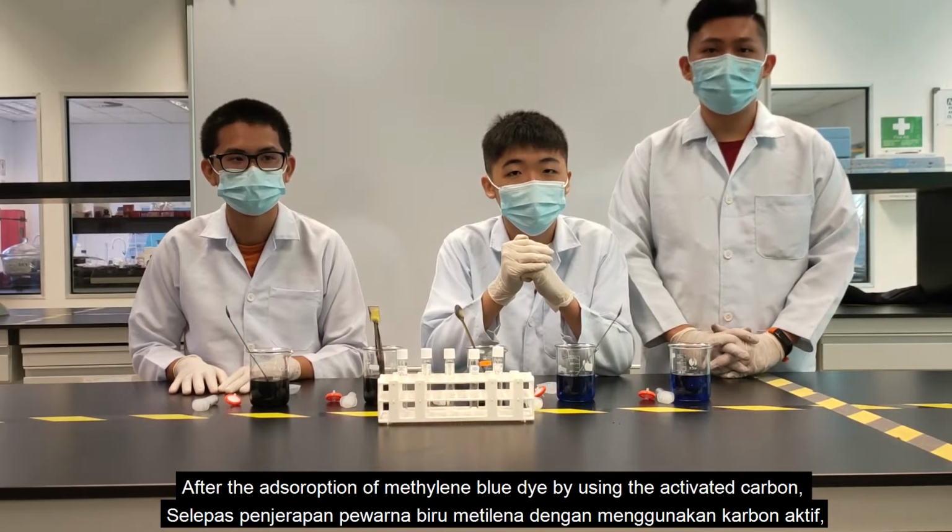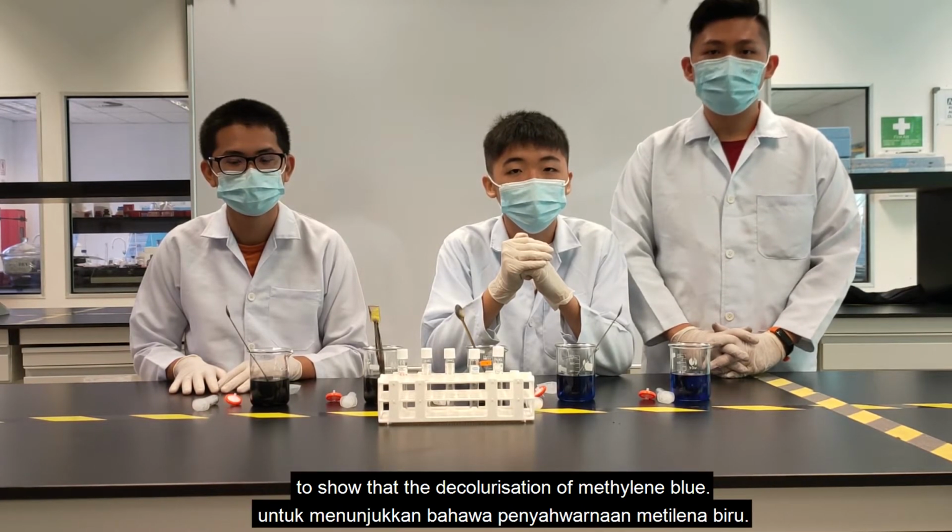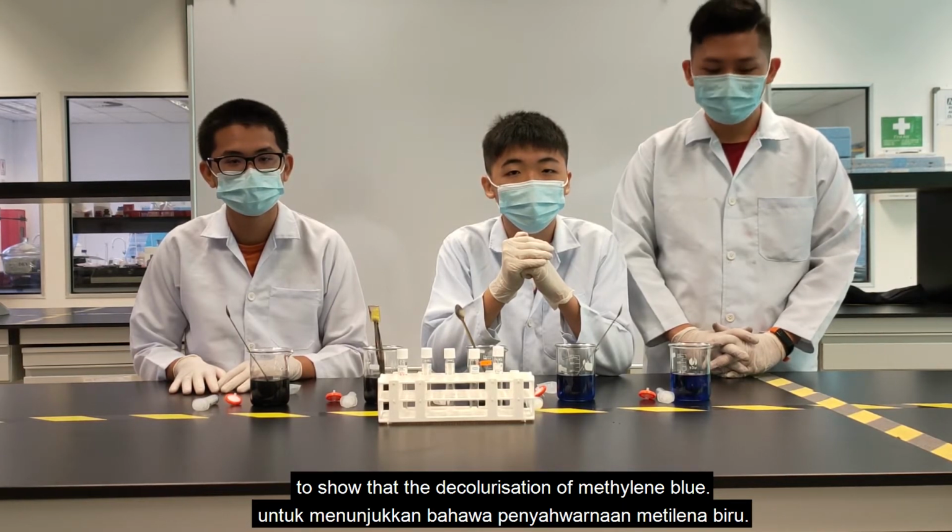After the adsorption of the methylene blue dye by the activated carbon, now they are going to filter out the activated carbon to show the decolorization of the methylene blue.